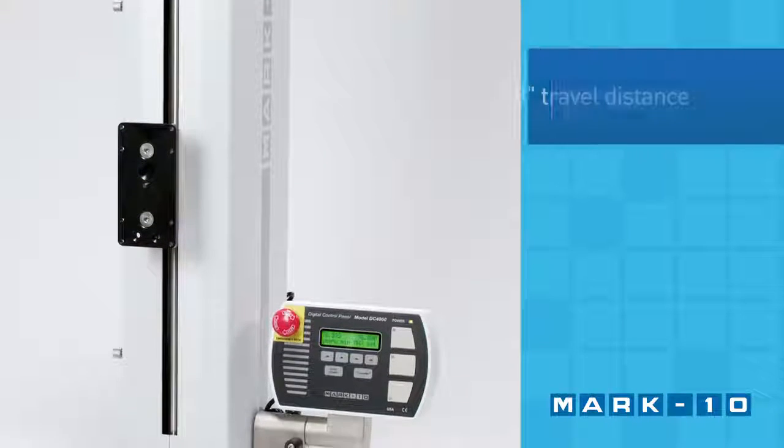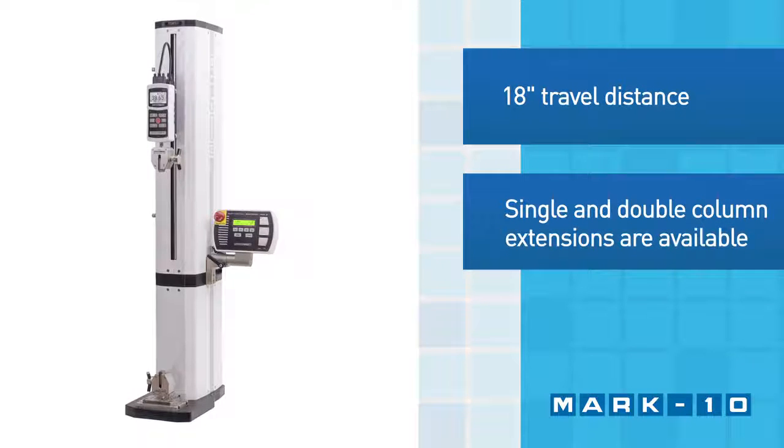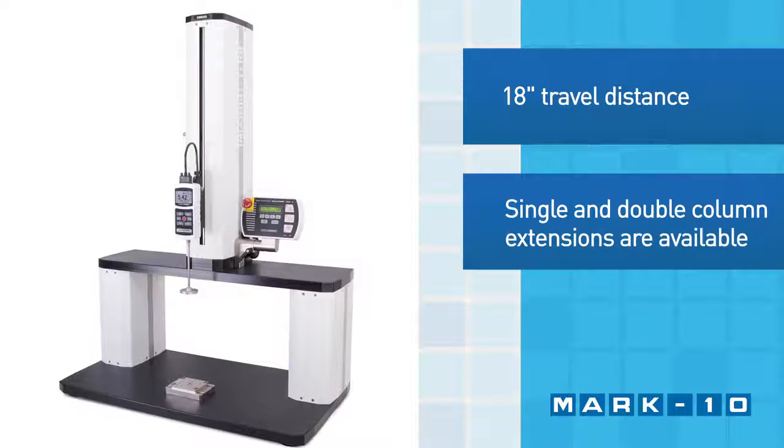The ESM 303 has a generous 18-inch travel distance. The clearance can be increased via single-column extensions or double-column extensions.